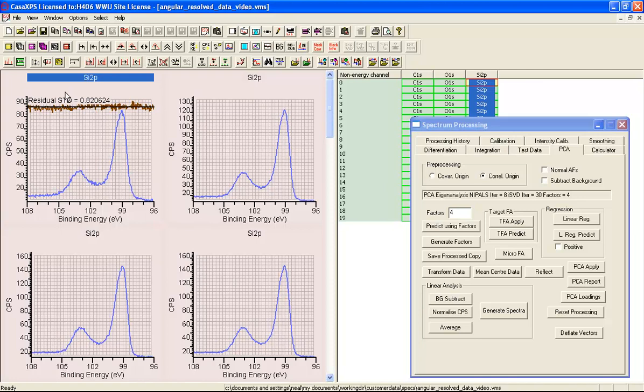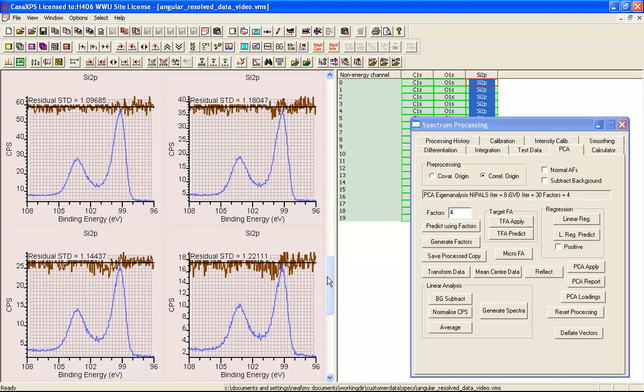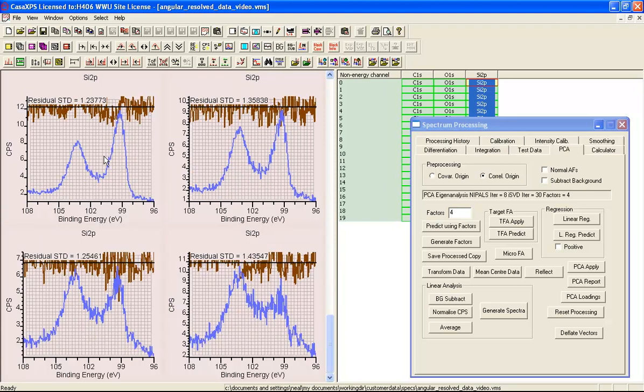It looks like Poisson type statistics, especially given that we have a multiple channel detector in the energy dispersive direction, so you tend to find that the residual is less than 1 and about 0.886, something like that. So if I look at all of these data, you can now see that there's one about unity, 0.9, 0.96. We go down, you can see that for data with significant signal, the residual is close to unity, and as you go further down where the data had poorer signal to noise in the first place, you can see the residual isn't quite so good as the more intense peaks.